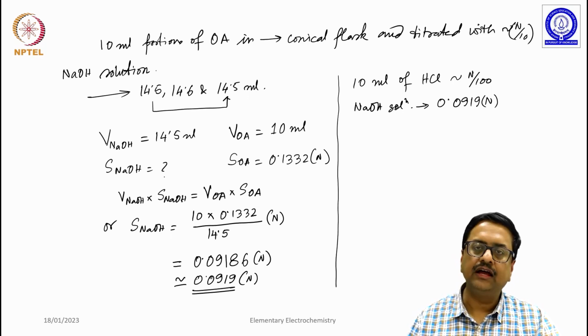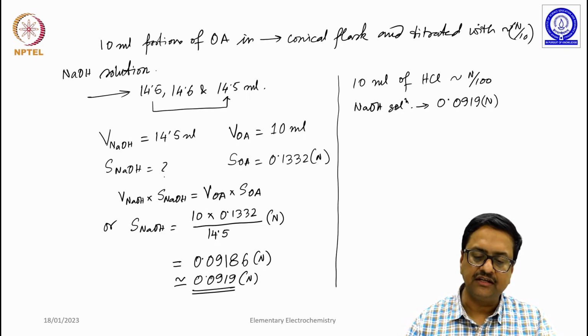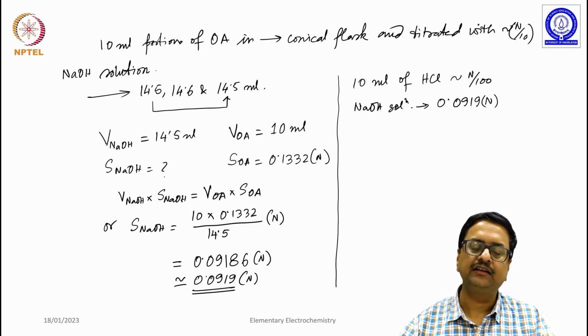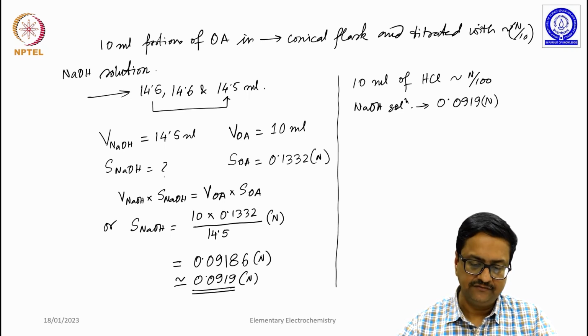And we did that experiment using a micro burette where one can measure a very small quantity of NaOH dispensed. So, we could take several readings with 0.02, 0.04 ml NaOH being discharged at a time and the pH noted.